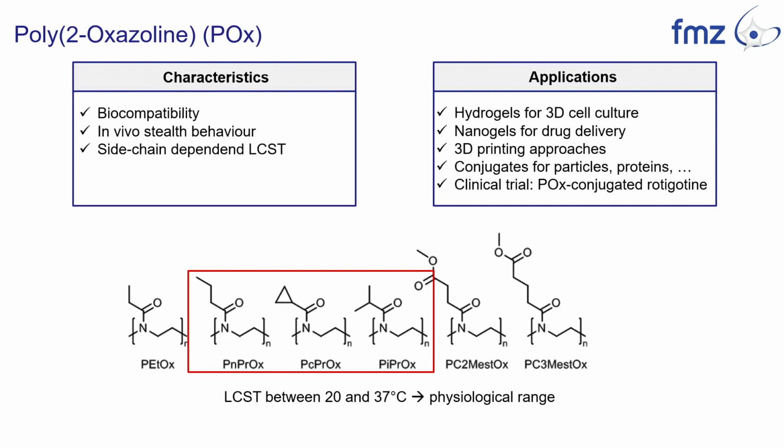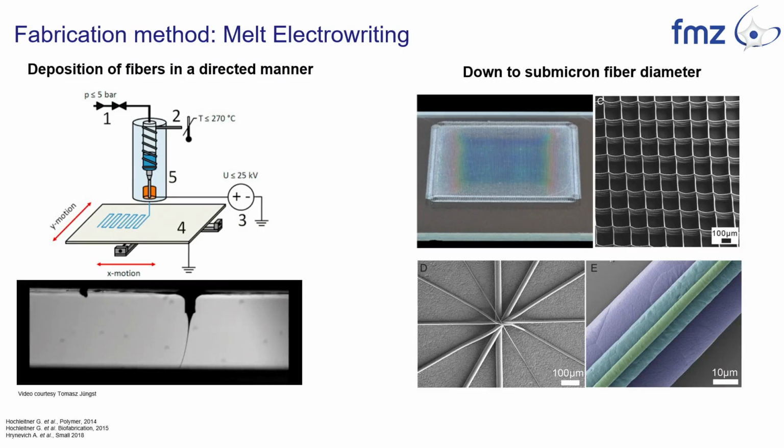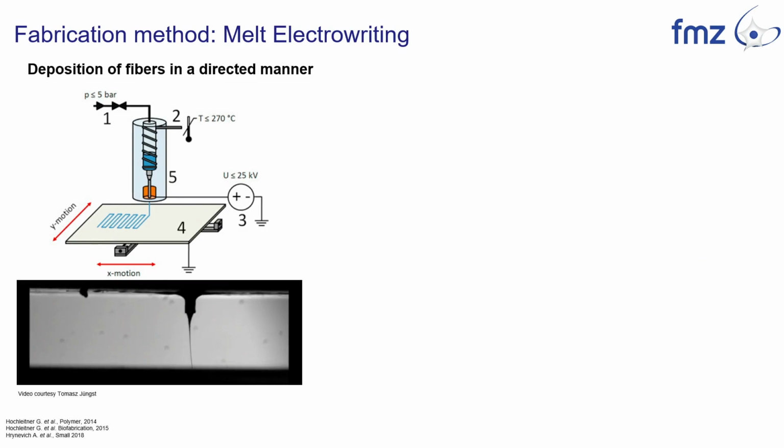So if you want to use this sacrificial property, this lower critical solution temperature for templating, you have to find a polymer which has this temperature in a physiological range. So every polyoxazoline with a propyl side chain is between 20 and 37 degrees, and we decided to use polycyclopropyl oxazoline for this because it has other positive features. Besides the material, you also need a fabrication method with a high resolution, and we chose melt electrowriting.